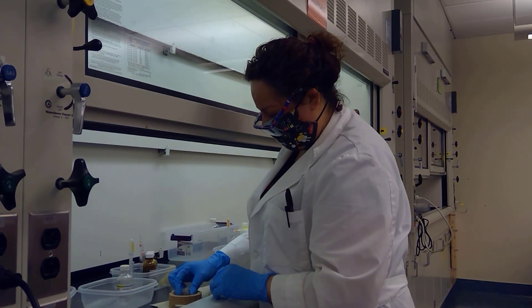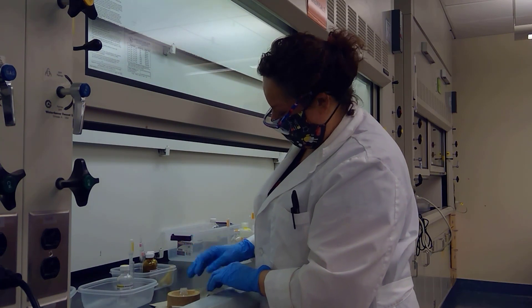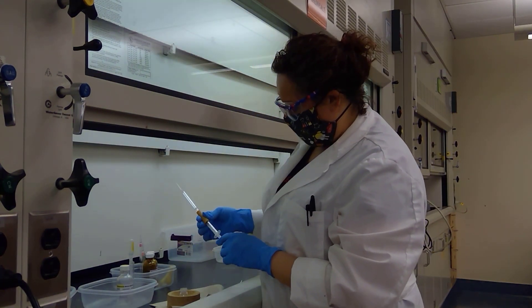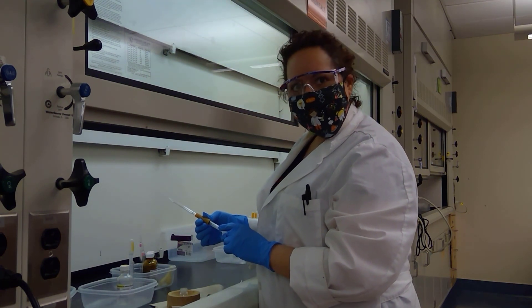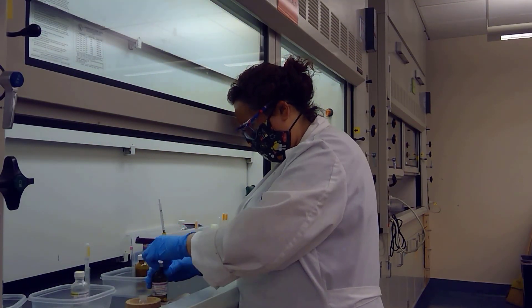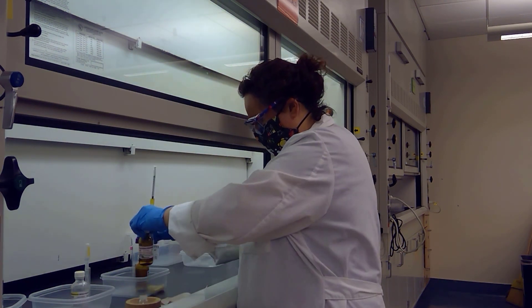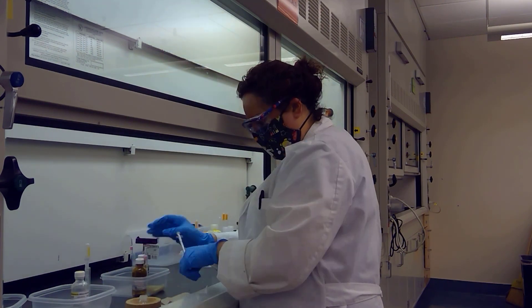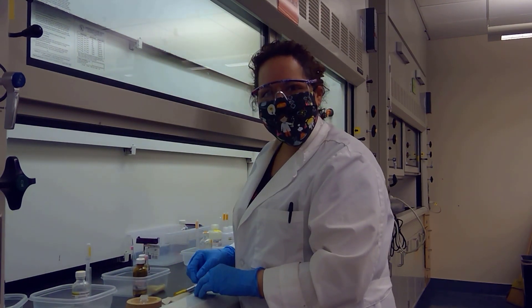The next liquid to add would be the ethyl iodide, and for that I'm going to grab a syringe. For this one here we're going to be adding 0.28 milliliters, and now our apparatus is ready for reflux.